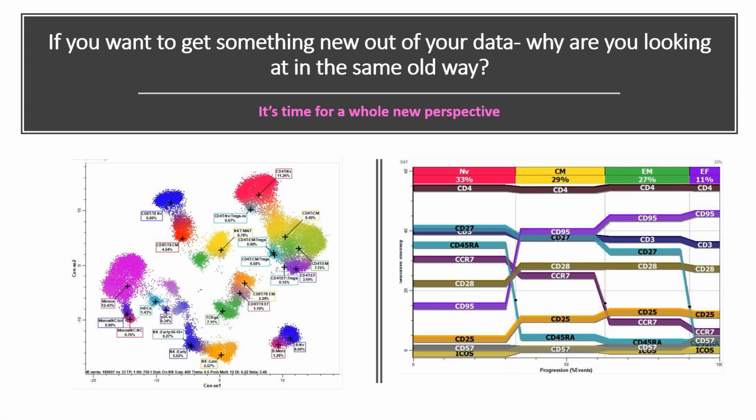So we understand that there are so many different analysis programs and algorithms to choose from. And there's also a great deal of confusion about the best choice for analyzing high-dimensional data. So we would like to offer you a solution that can not only analyze your data, but give you a whole different way of looking at it. GemStone has a revised user interface and added features that provides you with a comprehensive package that will help you get the most out of your data.